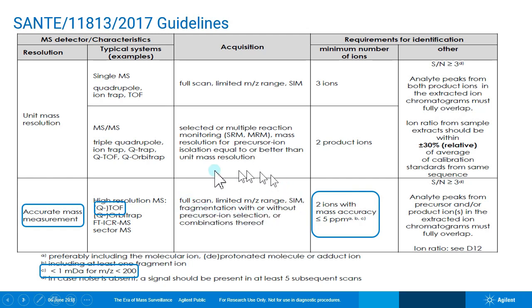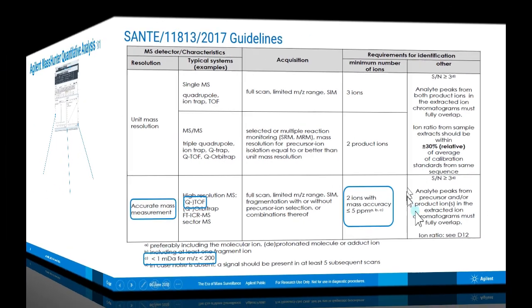So we're going to do all ions at other collision energies so we can match those up and see the fragments to get a confirmation. And last, it mentions that there needs to be a correlation, and we do that with the coelution coefficient to make sure that the targets and the qualifiers, as we're going to map these, do overlap.